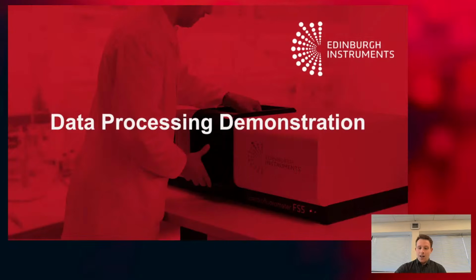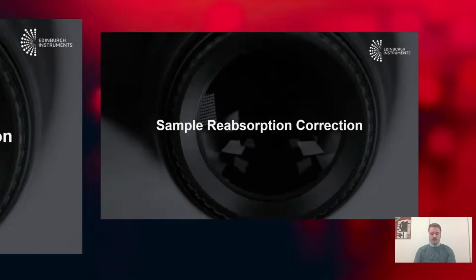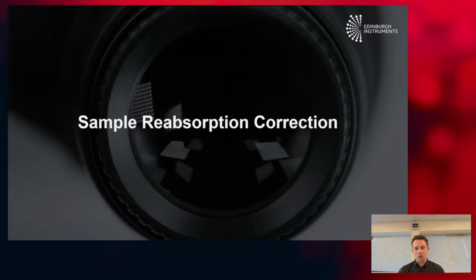So I'll hand over to Grant to discuss some of the difficulties that you might come across when you're doing PLQY in terms of sample reabsorption and how to correct for that.